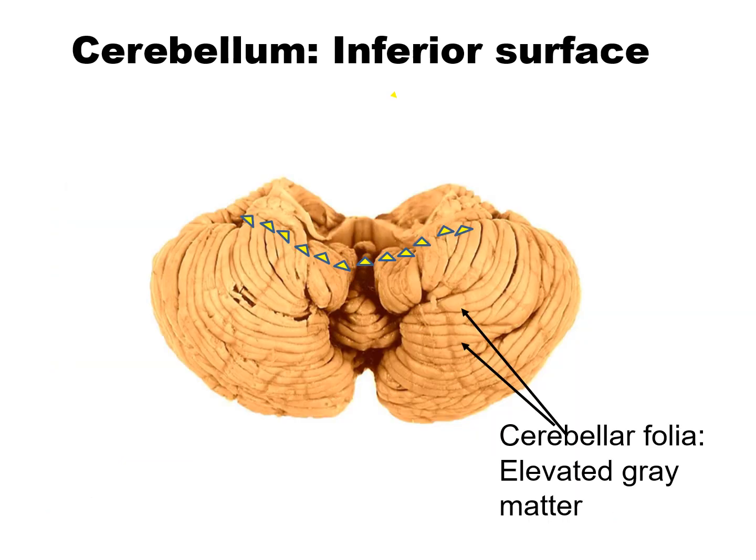The cerebellum, just like the cerebral cortex, has certain elevations and depressions. These elevations are called cerebellar folia.